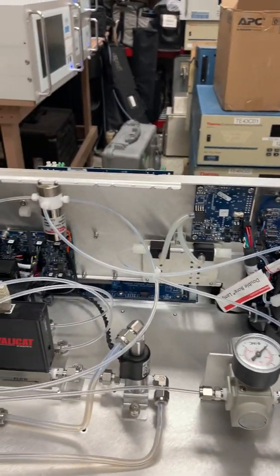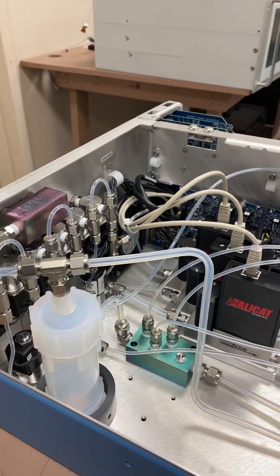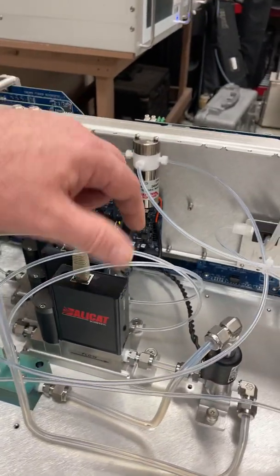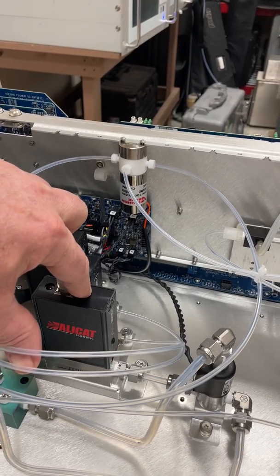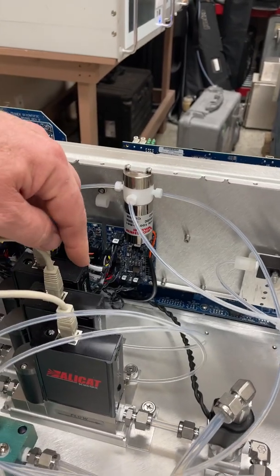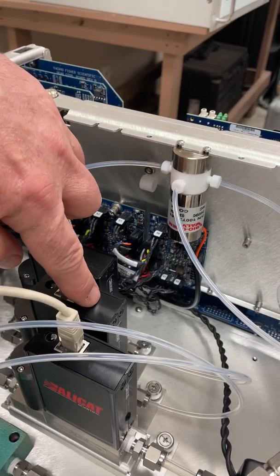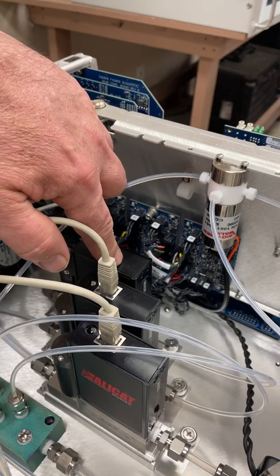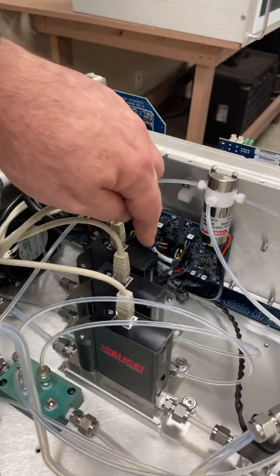The way this unit works is you'll have a zero air generator connected to the back of this instrument, pushing at about 35 psi of clean contaminant-free zero air. Inside this unit there is a flow controller which will regulate the flow of the dilution air — for example, 3,000 cc's of dilution air — and then mixing that with flow from your cylinder concentration. So you have a flow controller here which could be regulating your SO2 cylinder, or another one here which could be regulating your H2S cylinder, giving you an option of two flow controllers.